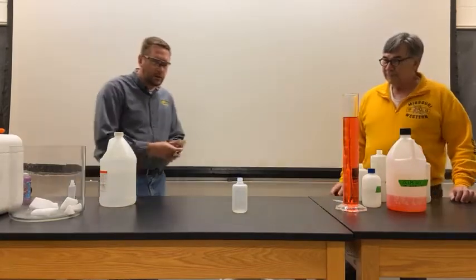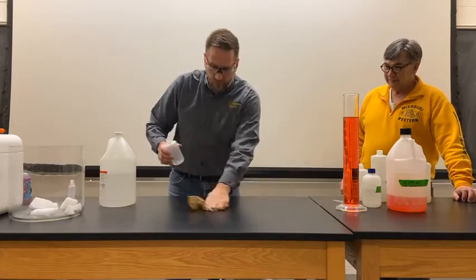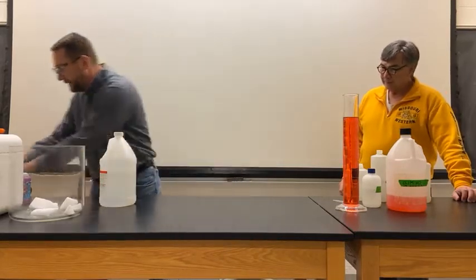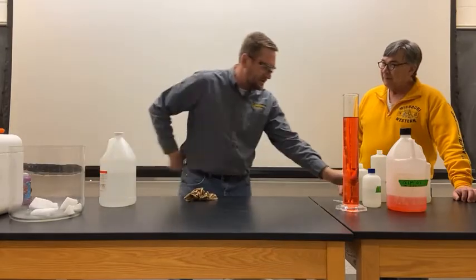There we go. Right, so you saw a lot more. Of course, we should have seen a little bit more out of that because there was a bigger bottle. Let's go ahead and continue to scale this up just a little bit.